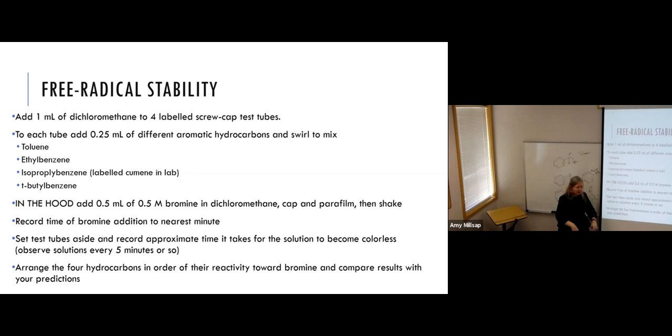When you finish adding the last one, there's this time. You cap them all and you leave the hood, you let the next person go. Set them aside. The closer they are to a light source, the faster the reaction will occur. So if you want to put them on that top bench.